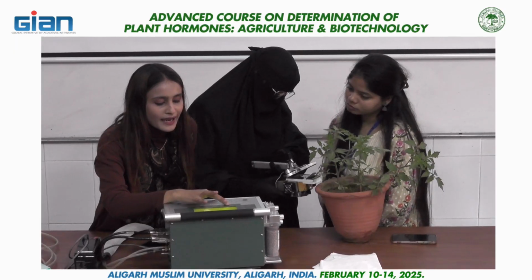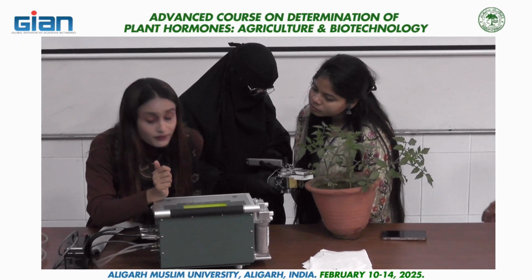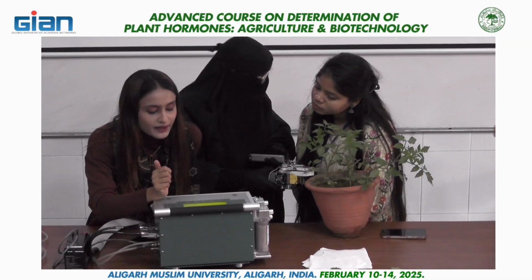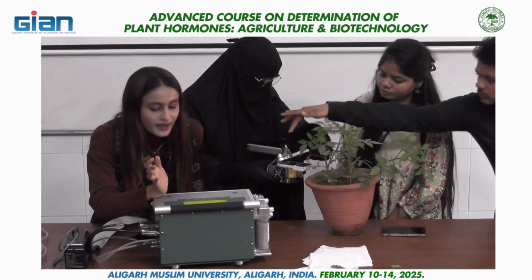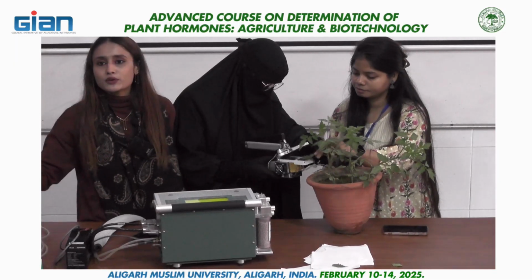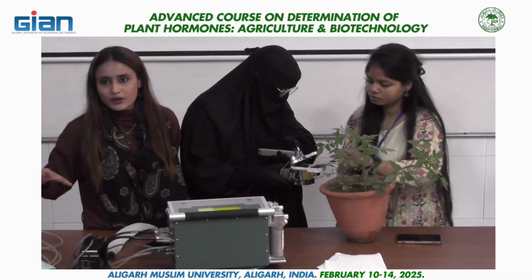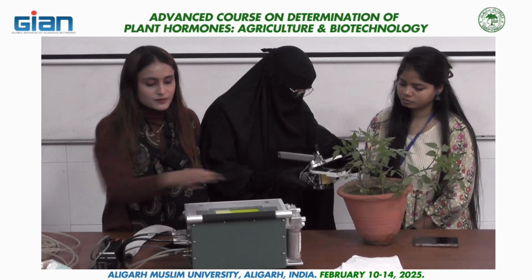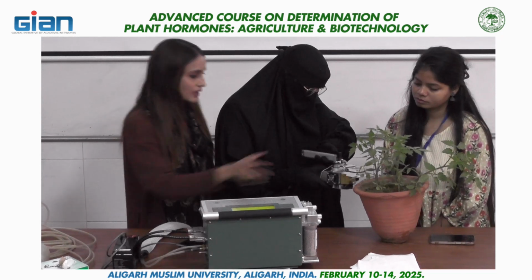For example, on F1 we have log, day, lane; on F2 view, clear; on F3 close, delete, change; and on F4 add, caps lock. So if we want to select add, we have to press key F4. There is no such tough task because this is not a touch screen. If this were touch, then we could simply touch and measure.